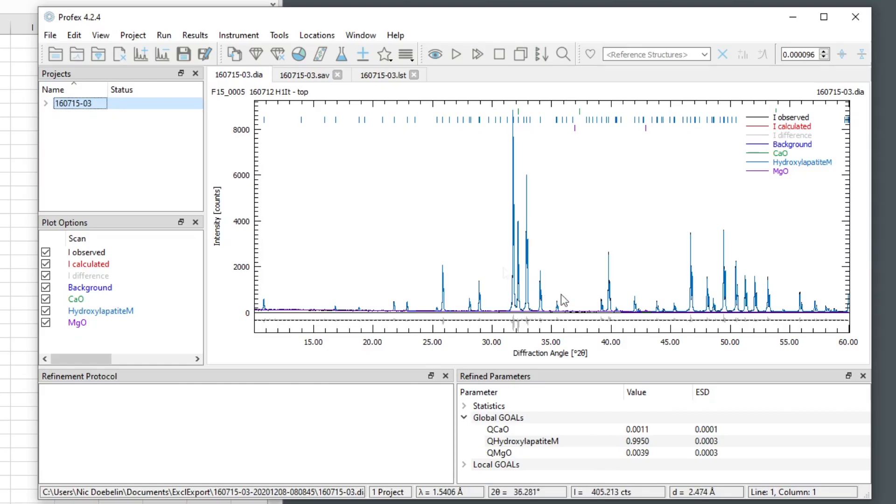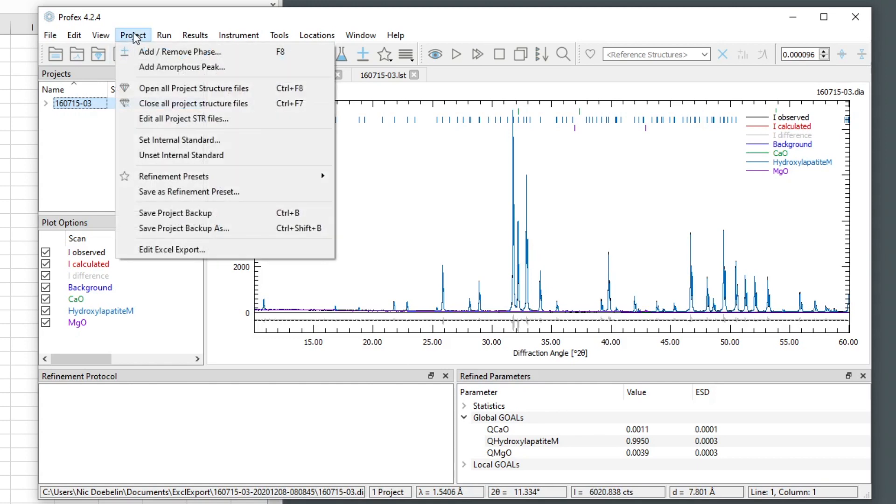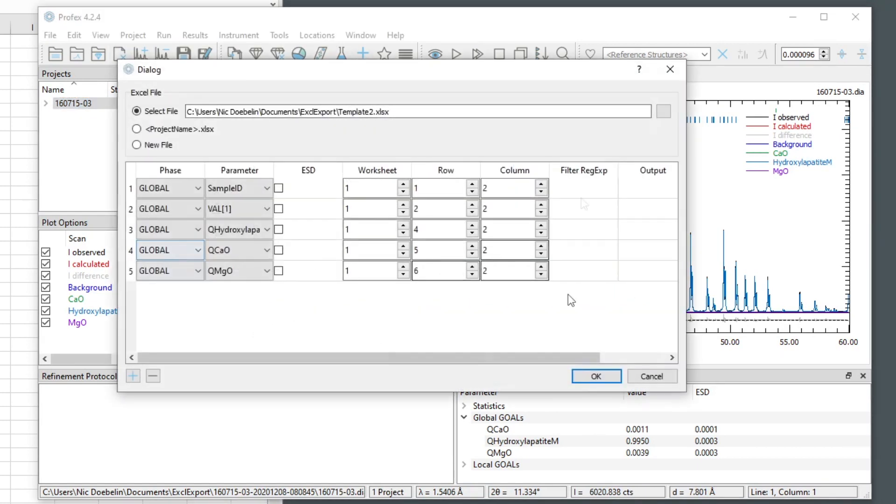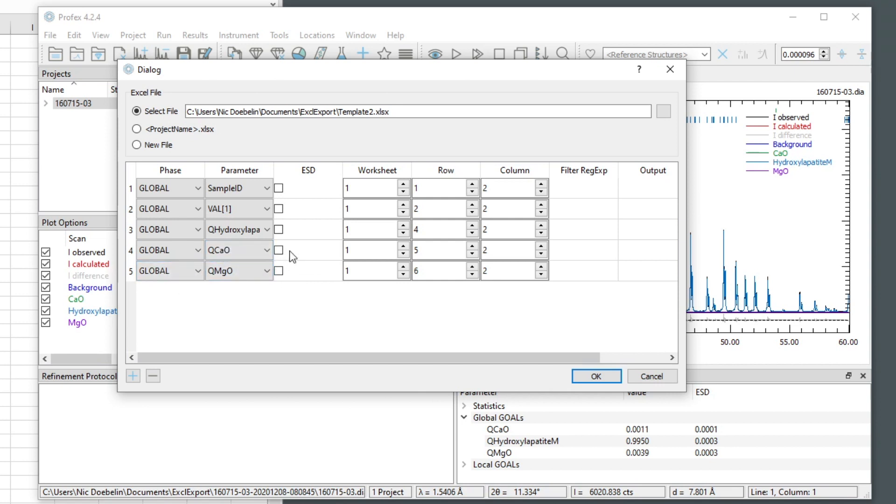Now let's look at some more options in this configuration dialog. I have a checkbox here in the column ESD. And if I check it, it will not output the value of this refinement result, but its estimated standard deviation.